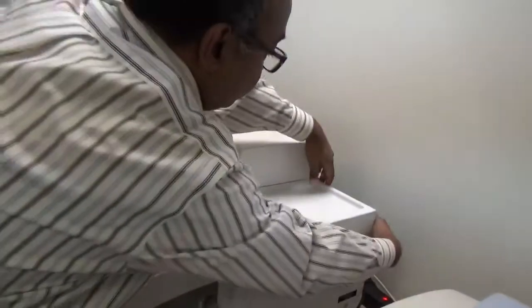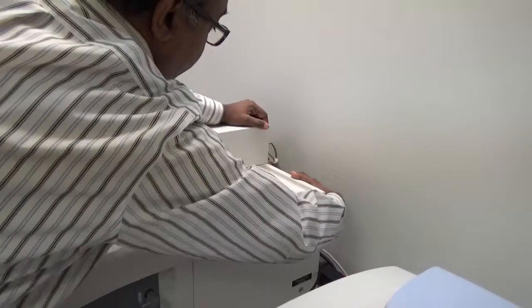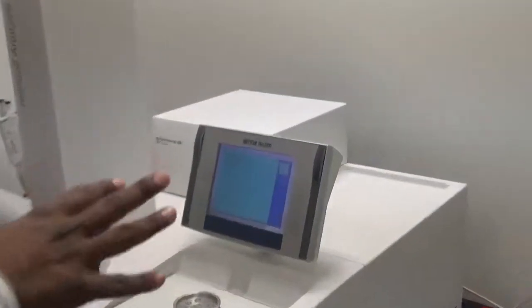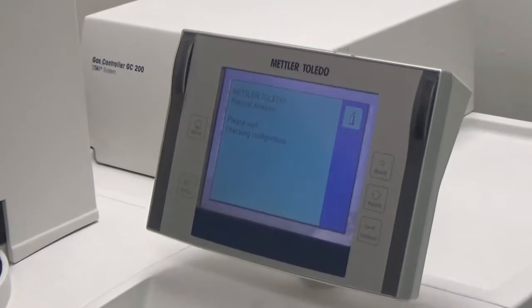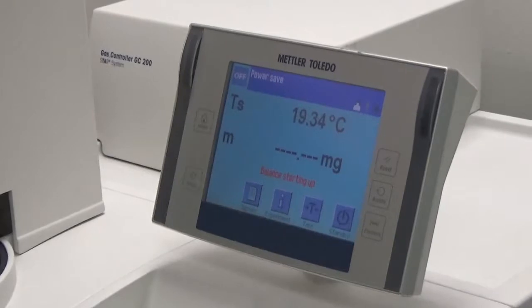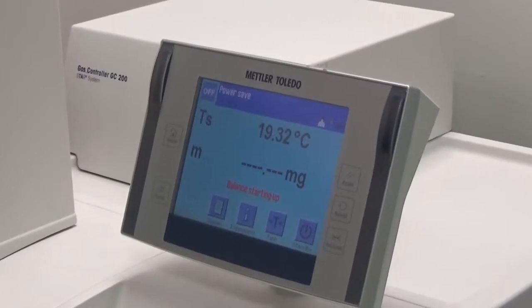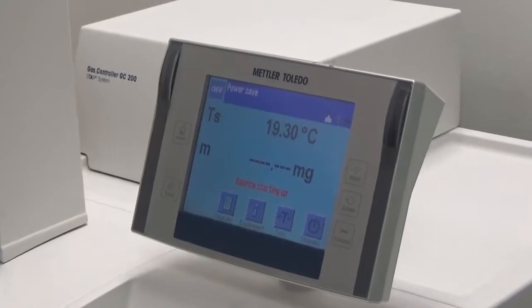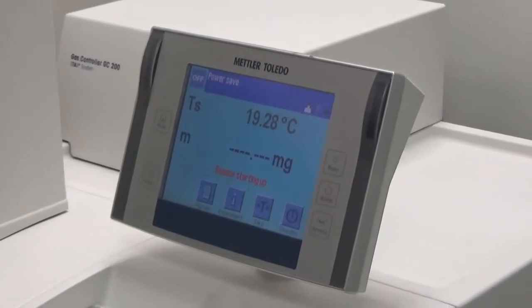To turn on the system, there is a switch on the back. Both the gas controller and the main unit are turned on together. When the switch turns on, this touch screen turns on. It goes to checking the configuration and tells us the balance is starting up. Once the balance starts up, it shows the temperature and the mass in milligrams. Pretty soon it will say 'software not found' because we haven't started the software to run the Mettler Toledo TGA DSC unit.